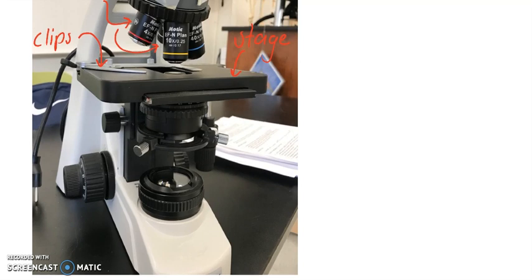Okay, so these two knobs right here, they bring the stage up and down closer to the objectives. This tool here, we call this the coarse adjustment. And this up here, this is the fine adjustment.